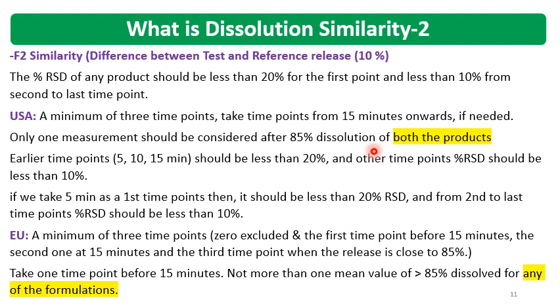But this is not the case with the US requirement. Here only one measurement should be considered after 85% dissolution of both the products. But here, 85% dissolved for any of the formulation.